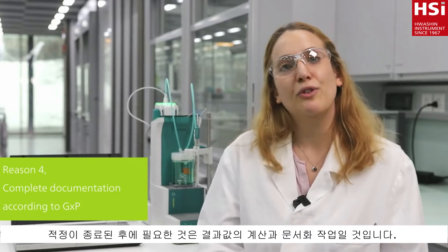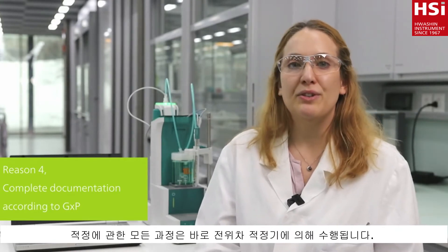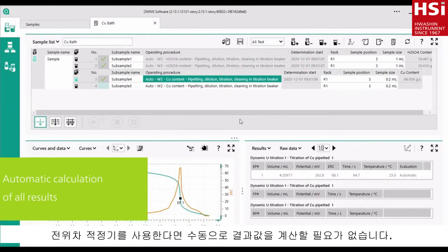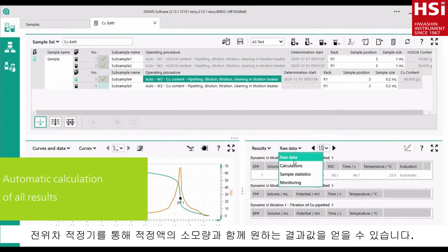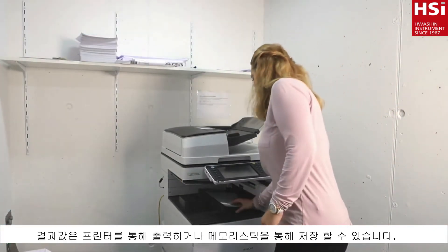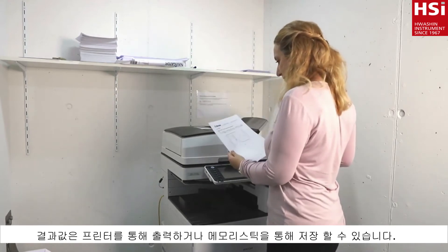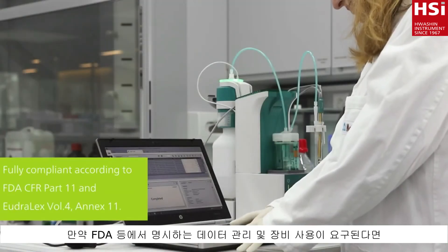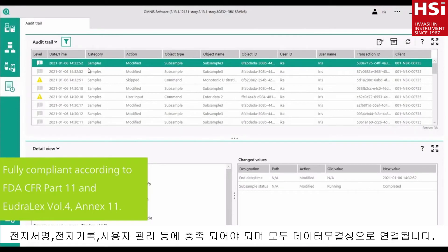After the titration is completed, I need to calculate the result and document it. With an automatic titrator, this is all done by the instrument itself. This is my reason number 4 why I switched to automatic titration. With an automatic titrator, you don't have to calculate the results manually. The titrator will do this for you and display the results together with the titrant volume. Then you can print out the result, save it on a memory stick, or send it directly to your LIMS system for documentation. If you are working in a regulated environment, all steps, all changes, everything is documented, ensuring full compliance and data integrity.